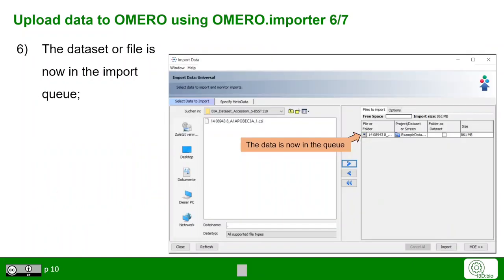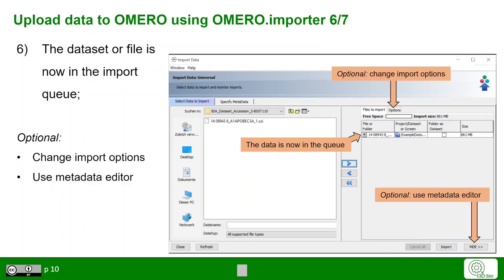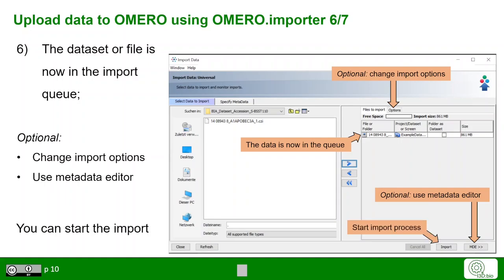You will now find the data in the upload queue. Before clicking Import, you can change the import options or optionally use the metadata editor, here called MDE. Once finished, click Import to start the process.